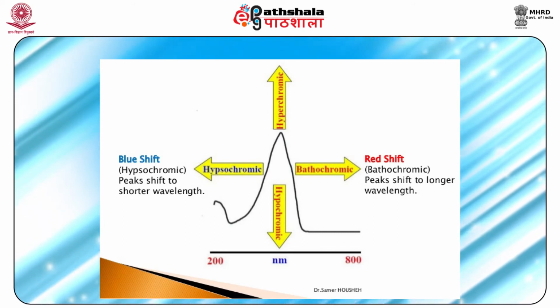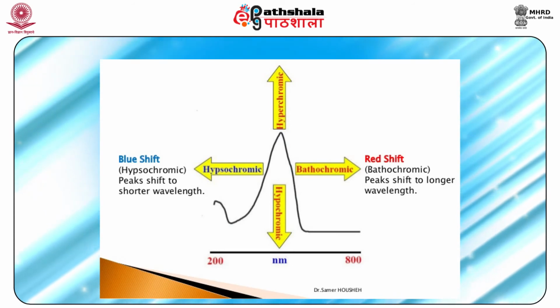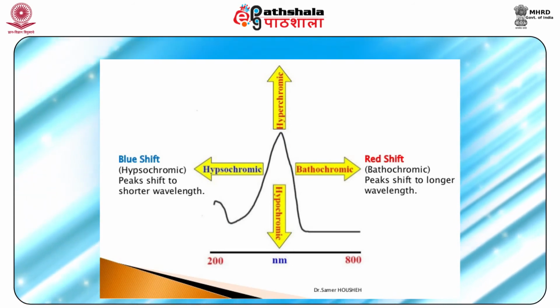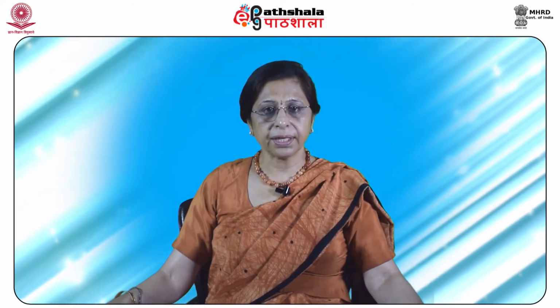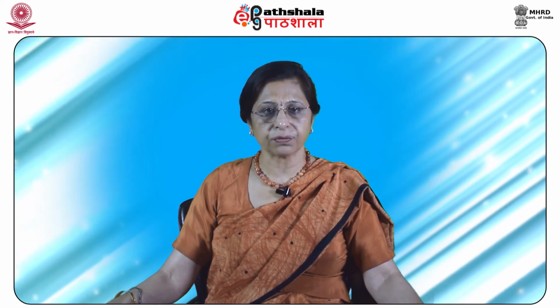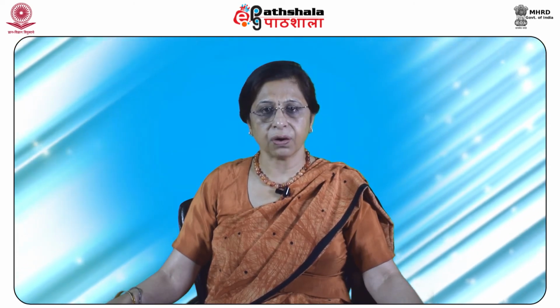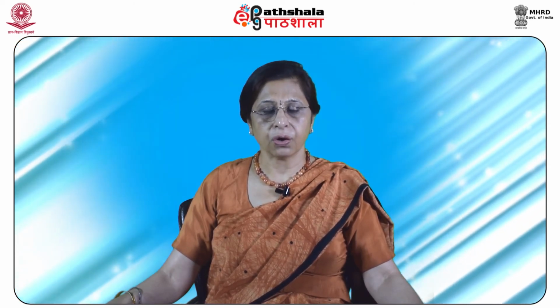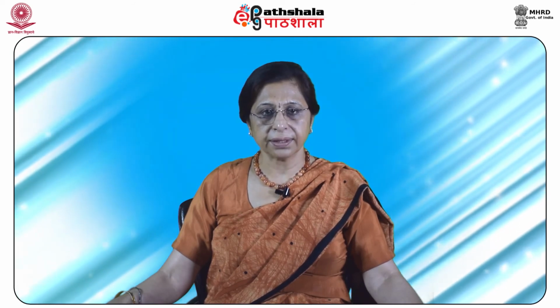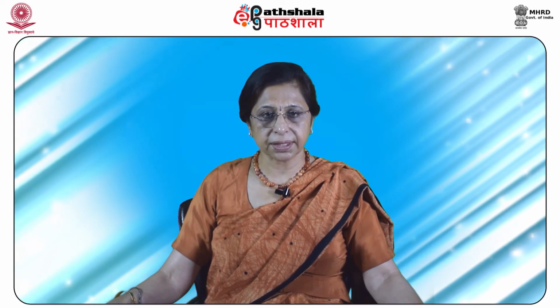The presence of conjugation not only increases the absorption wavelength, but it also results in increase in intensity of absorption. The electronic energy levels come close to each other in the presence of conjugation, which results in the transition of lower energy or of longer wavelength, as is explained in figure 6.